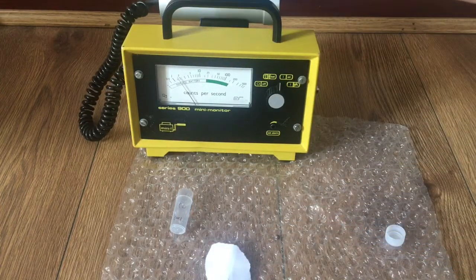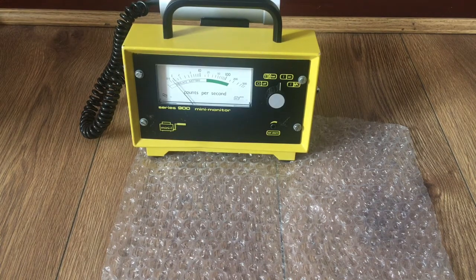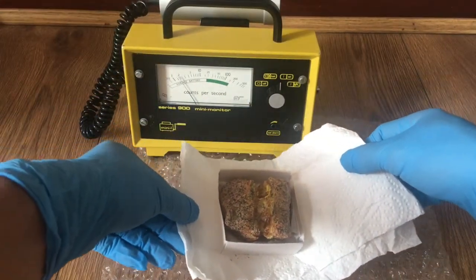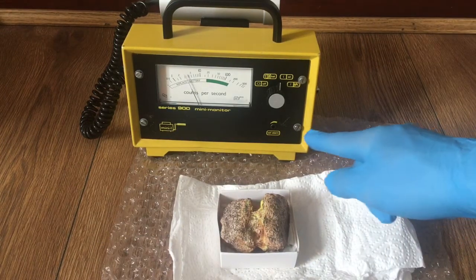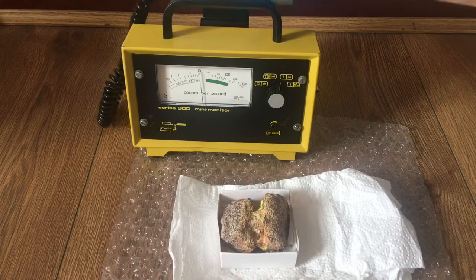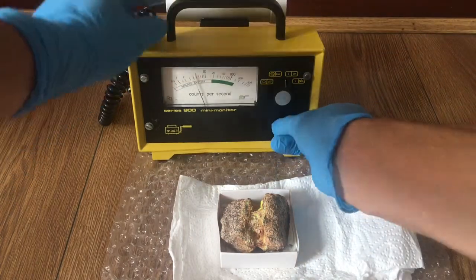Now let's have a look at a uranium sample — a very hot one. I want you to watch the counts as I bring the sample closer. This is the alternating alarm, and the alarm we set will activate about here — quite annoying — so we're going to set the alarm higher.